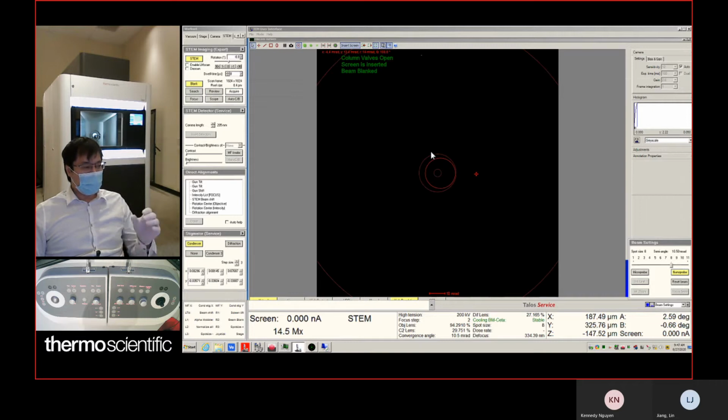With the channeling effect, the gaps between atoms give less signal to the detector, while the atom columns themselves deflect more electrons and X-rays, which get collected by the detector.